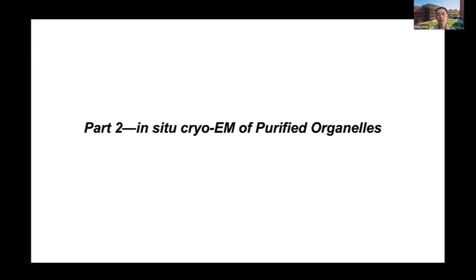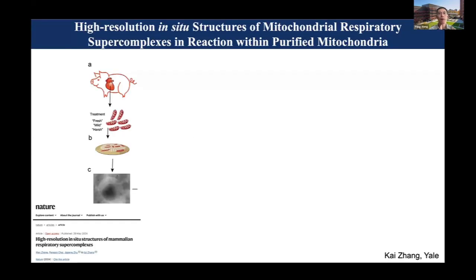Say we want to do in situ cryo-EM of purified organelles. Again, it's not a purified sample. It's a piece of the cell, and it contains everything. I want to highlight this with a study from my colleague Kai Zhang's work at Yale. It was published last year. So what Kai's lab did is this.